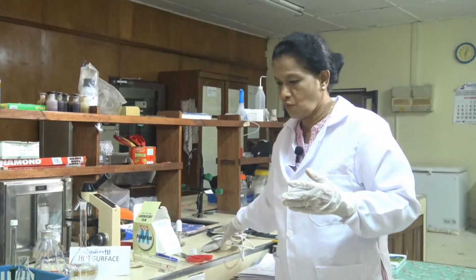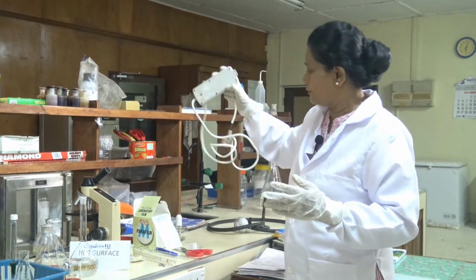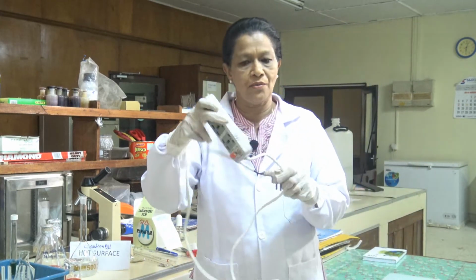Sometimes you may need to work with extension cords. If you see any cut or damaged part in the extension cord, do not try to repair it using normal tape.